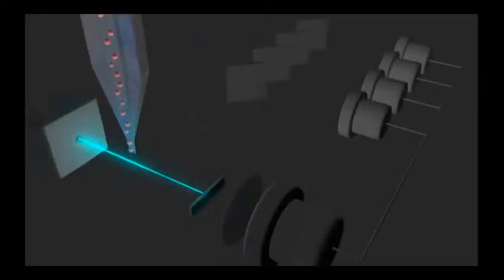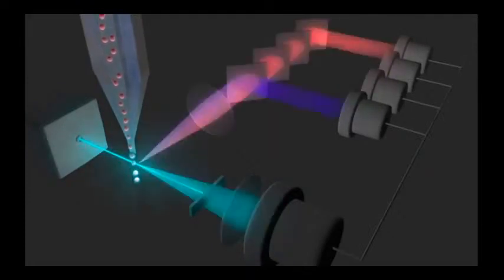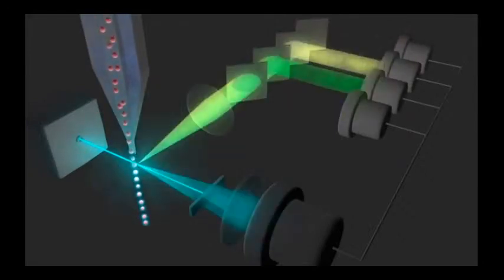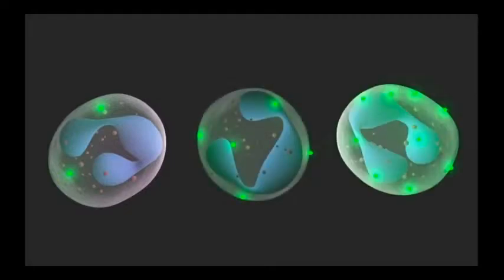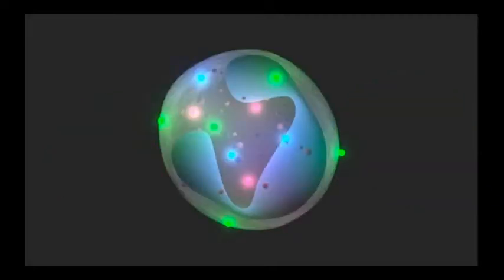The fluorescent molecules, or fluorophores, are excited by the correct wavelength of laser light when the cell passes through the laser beam. After excitation, the light emitted by the fluorophore is directed along a path with emission filters that allow for the detection of fluorophores emitting light in a cell. A flow cytometer can detect the presence of a fluorophore and also quantify the relative amount of a fluorophore within a cell. A flow cytometer can also be used to detect light emitted from multiple fluorophores in the same sample.